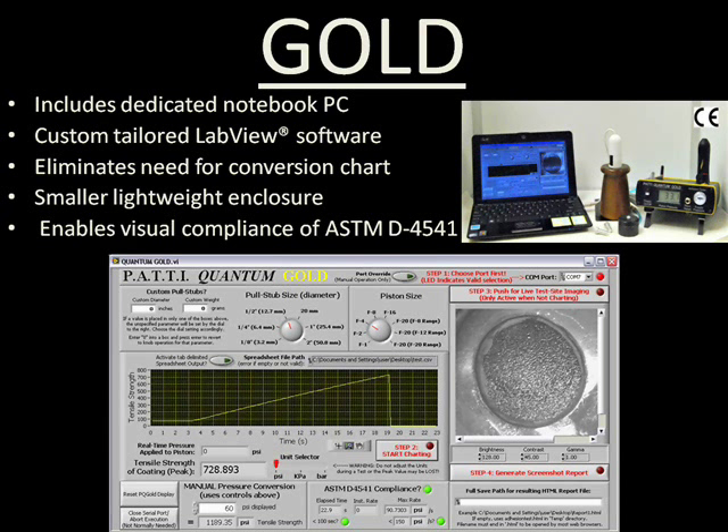The Quantum Gold package is by far the flagship Patti model. It includes a dedicated notebook PC preloaded with Semmicro's custom-tailored LabVIEW software, which automatically makes all conversions for you and delivers a seamless report generation process. In addition, the Quantum Gold provides wireless Bluetooth and a digital camera, which increase productivity by limiting the time it takes to record and archive results.